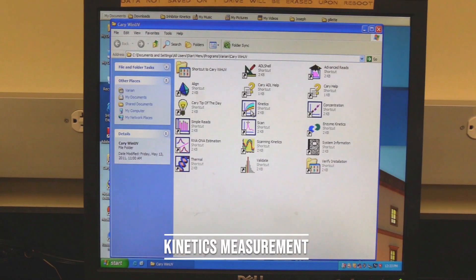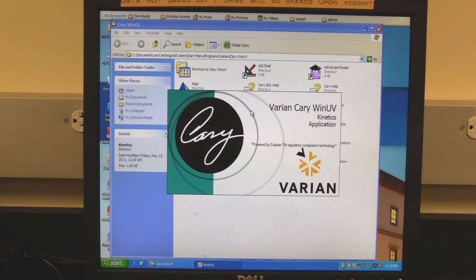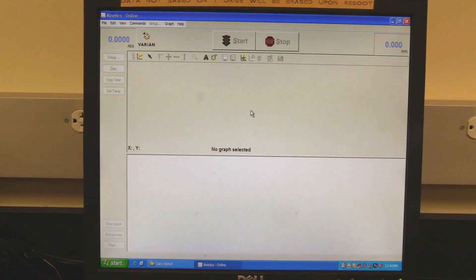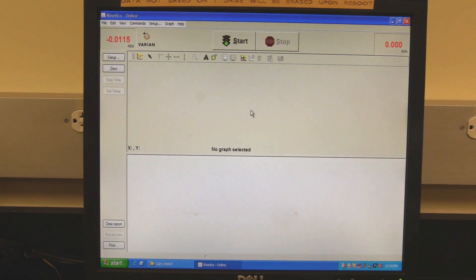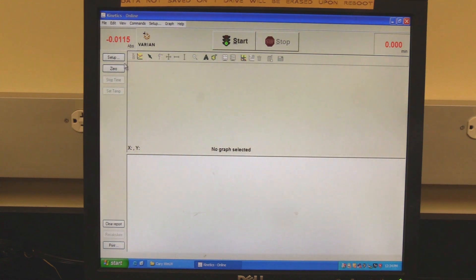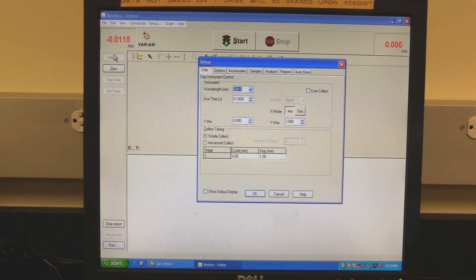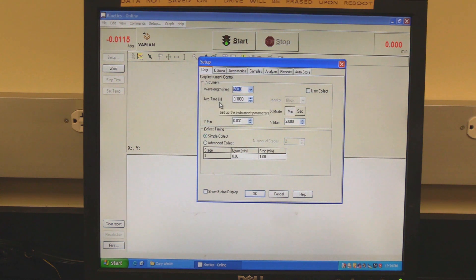Kinetics measurement. In the Cary Win UV folder, double-click on the kinetics icon. Wait for the software to open and initialize. The instrument will be finished initializing when the absorbance reading turns red. Click on setup to set measurement parameters. Setup should open to the Cary tab. In the instrument section, set the desired wavelength, average time, and X mode time scale in minutes or seconds.